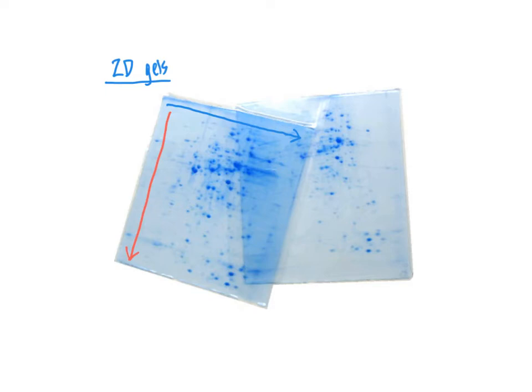But assuming the automated analysis works, what will turn up from this is something like this, where we have superposed the treatment and the control using appropriate software. And there are several softwares suitable for this that are specialized for this. So this would be superposition of the treatment and the control 2D gel images that have been stained with silver, Coomassie, or whatever the preferred stain is for the particular experiment that you're doing.